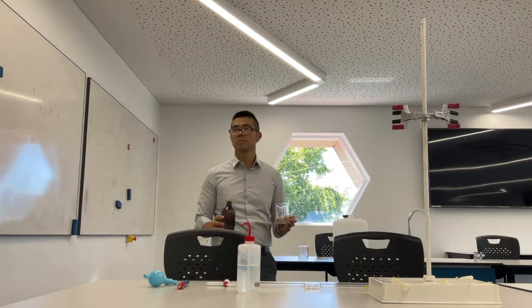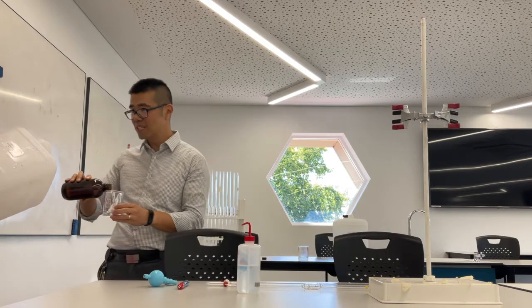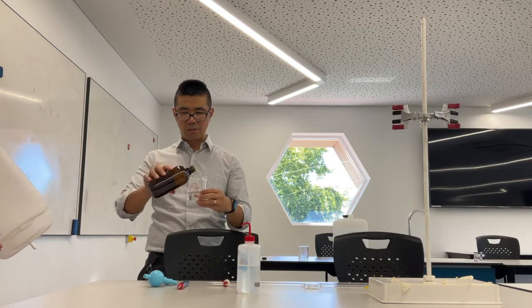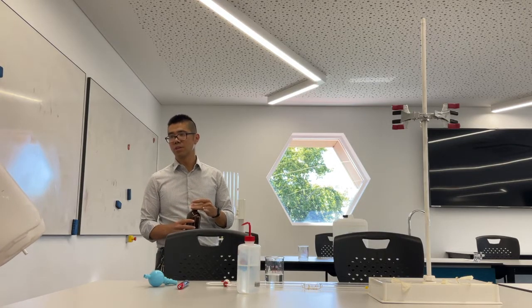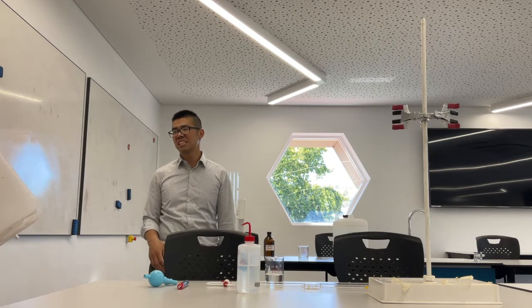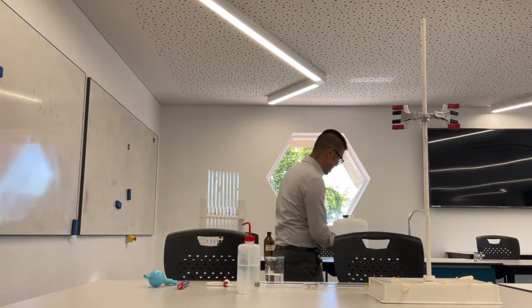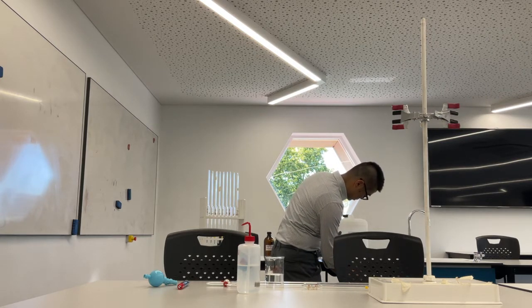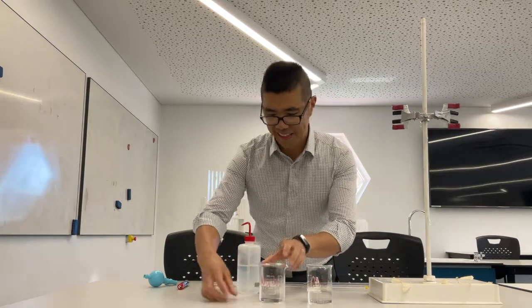I'm going to pour out the reagents. I'm getting some HCL. And now we get on to the NaOH. With those bottles, you should open up the lid a little bit to let the airflow when you open up the tap, so the tap twists and then you can pour the fluid in. So now I have HCL and NaOH.